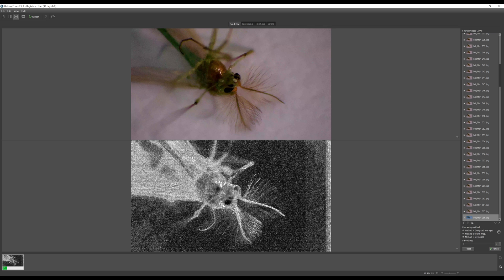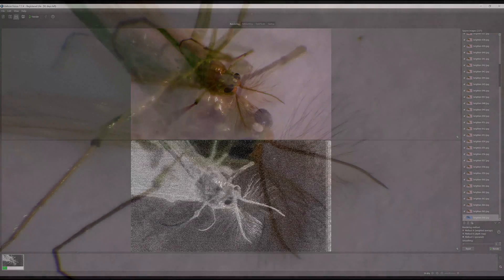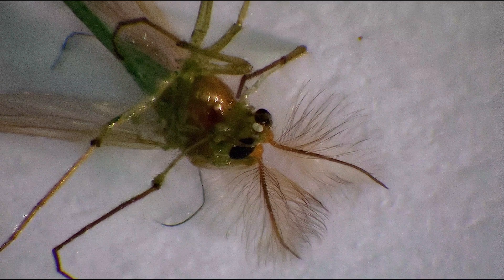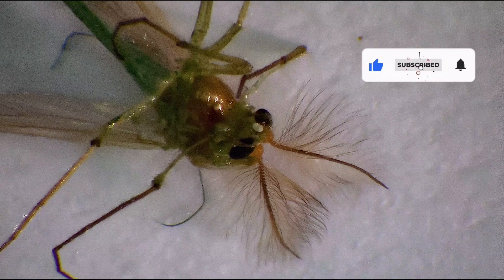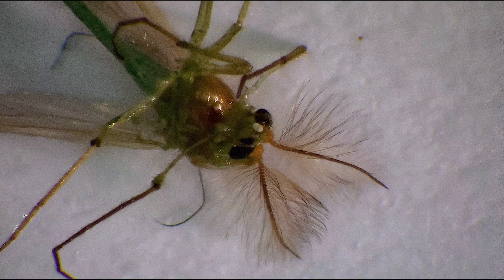If you want to see the complete process, you can check out my video where I zoom into a beard under a microscope — I show the whole process there. Here is our final stacked image. I quickly edited it in GIMP, changing the color a little and adding some contrast and sharpness. This microscope setup costs about $250, and I think you could get a much better image with a better camera on top of the lens.